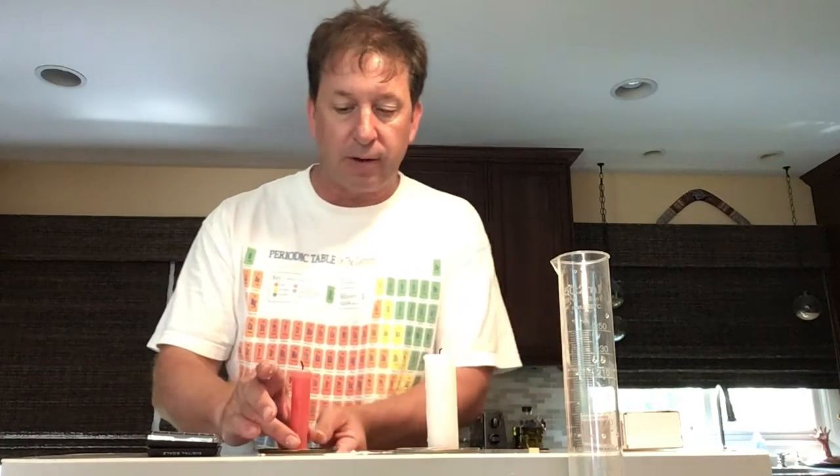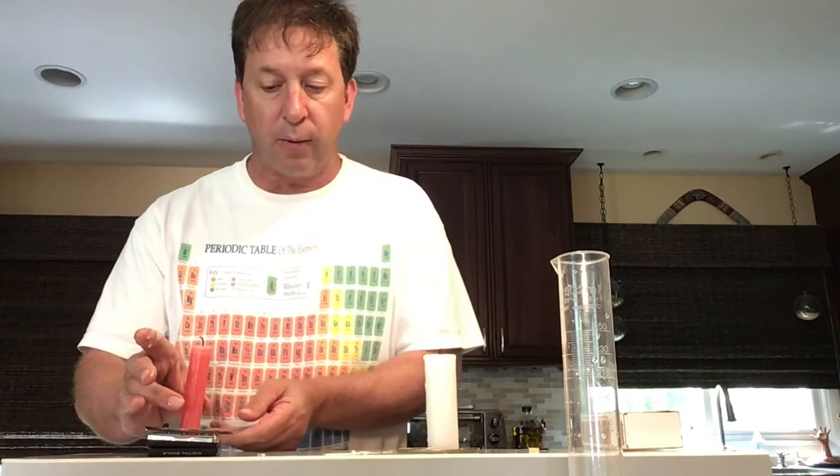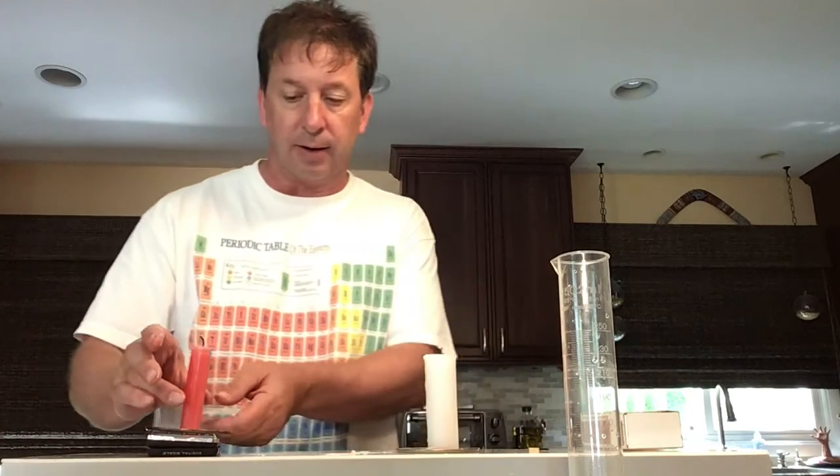afterwards. So here's our balance. We're going to turn it on. We're going to tare it, make sure it's reading 0, and then we're going to record the mass afterwards, all right? Again, we've collected all the wax before and all the wax afterwards, okay? And we're going to see what happens to the mass.